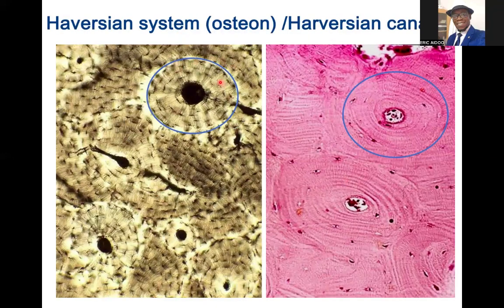So another cross section, that will become one osteon. You have the Haversian canal in there. All the black spots are osteocytes sitting in lacunae. So again, that is how you find the circumferential pattern forming the osteon. That will be a Haversian canal. You can have another osteon there. That is a lacuna, that's the white background, and then the dark spot inside will be the osteocyte sitting in there. And all these extensions are actually canaliculi.